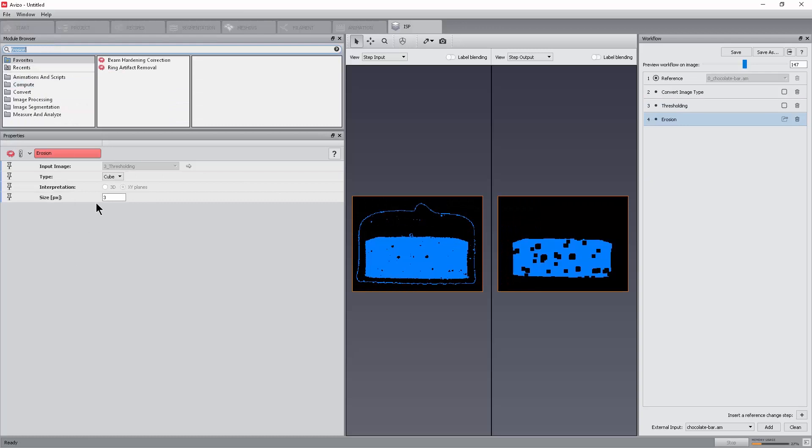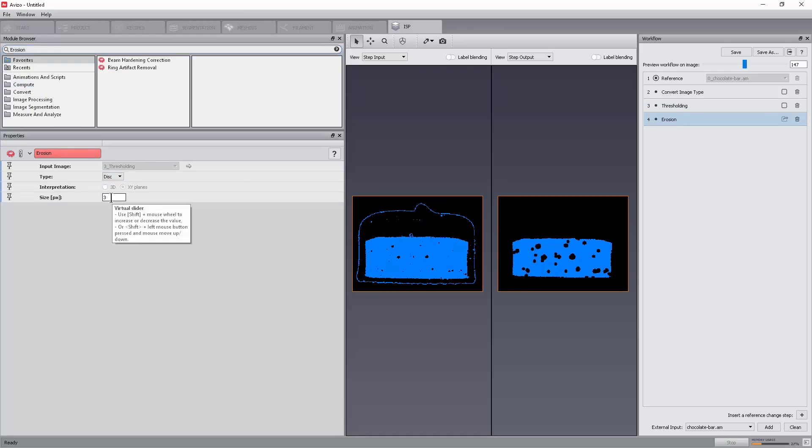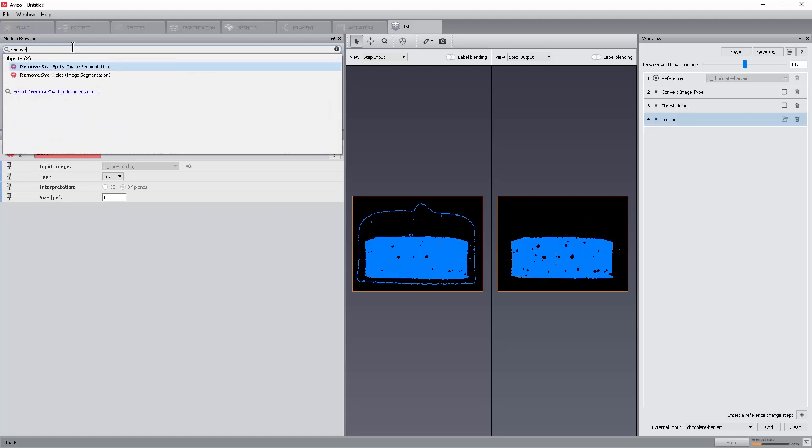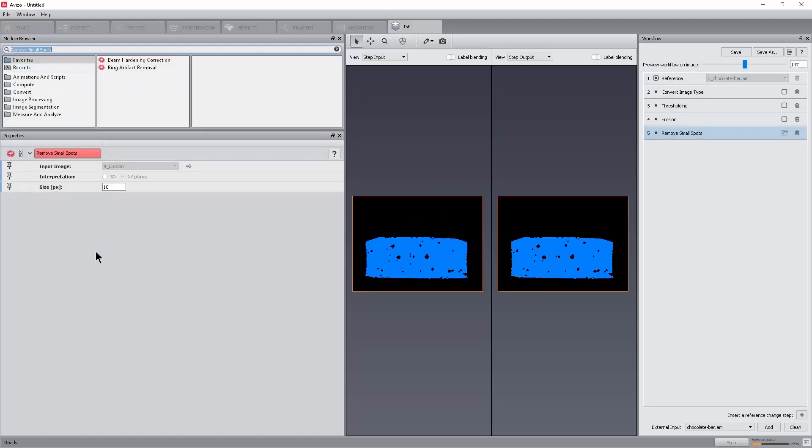An erosion to erode selection and reduce noise around the chocolate bar. Set the type to disk and size to 1. Remove small spots to eliminate caramel residuals. Set size to 200.